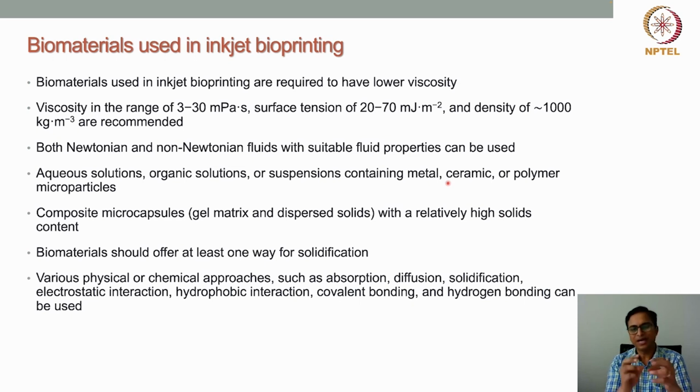But as soon as it comes out of the nozzle and we deliver it to the printing stage or substrate, it should transform from the liquid phase into a gel state or solid state. That capability should be there when a biomaterial formulation is used for inkjet bioprinting.